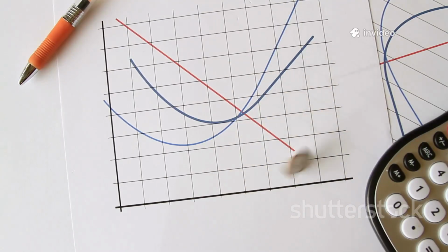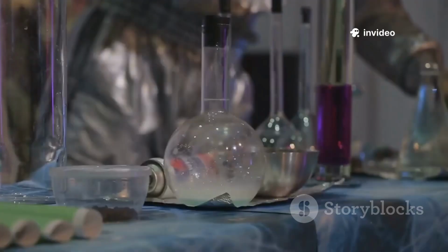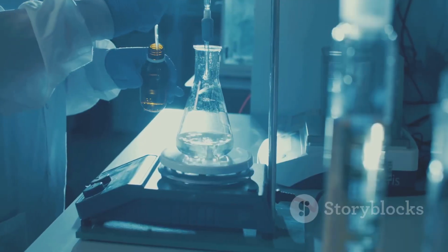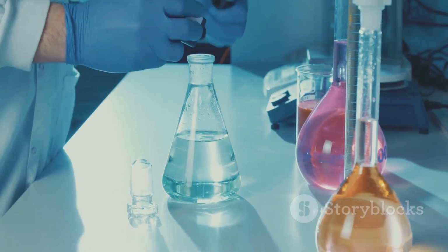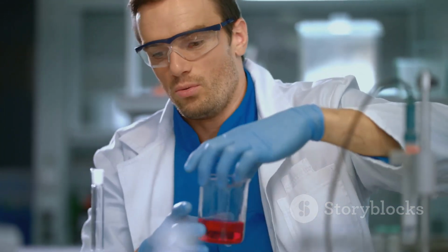No guessing, just data. Conductometric titration is a lifesaver when solutions are colored, cloudy, or when indicators just won't cut it. Plus, it's quick and precise. What's not to love? So next time you're stuck with a tricky titration, ditch the color and follow the current. You'll look like a pro, and your results will speak for themselves.